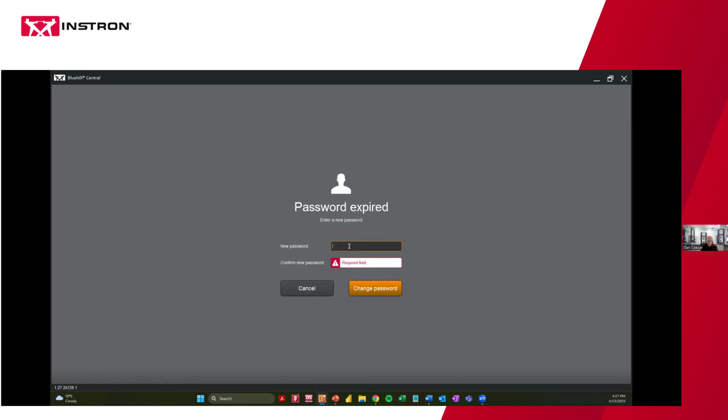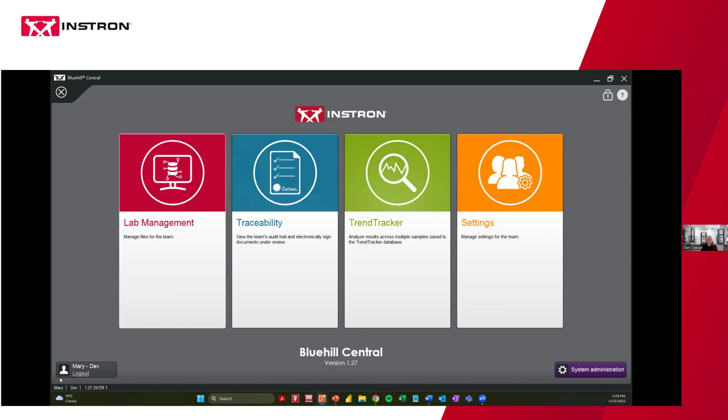It says it's expired. Then Mary can set her own password. And now Mary is logged in. Again, she's an admin just like me.